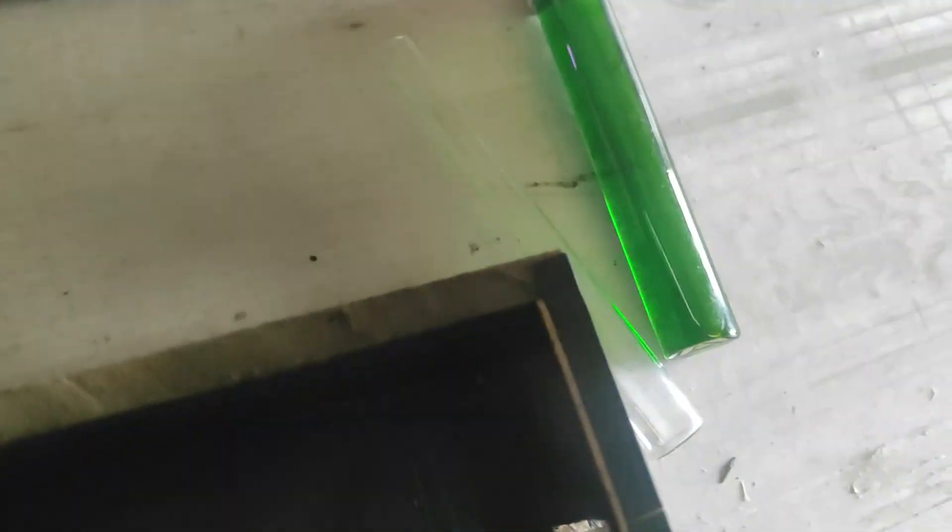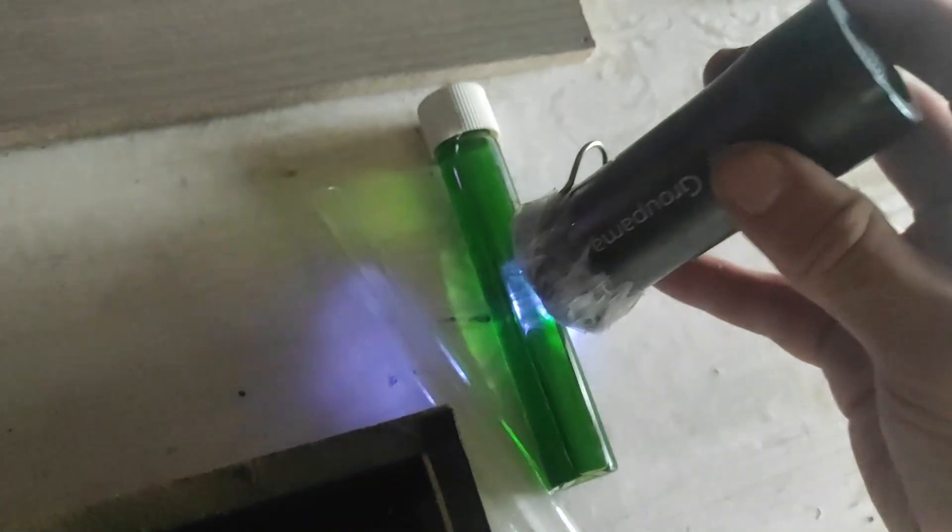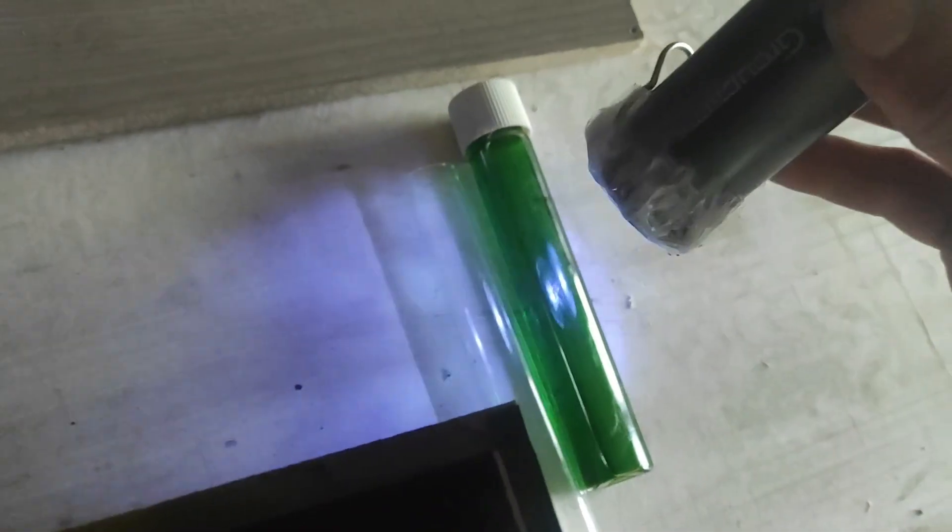Now we're going to measure the fluorescent emission of the chlorophyll, and to do that, I will use my false UV lamp from earlier. As you can see, we don't observe anything in the sunlight, so we need to go in a dark place.